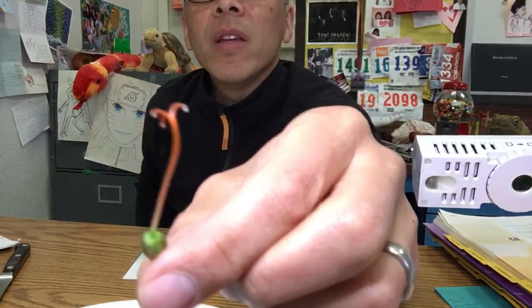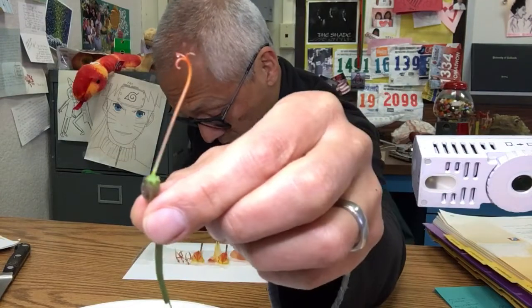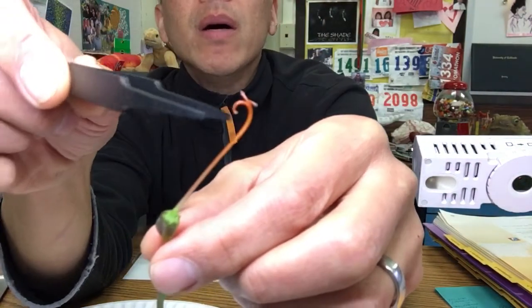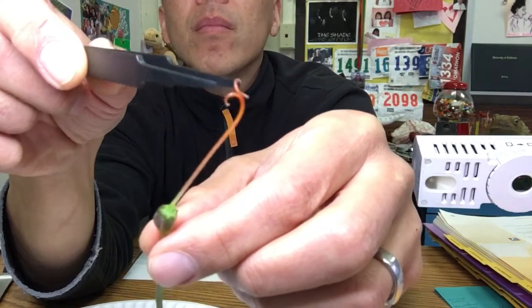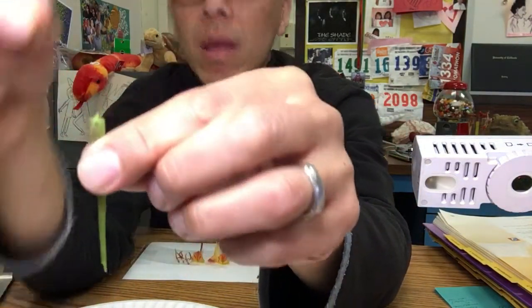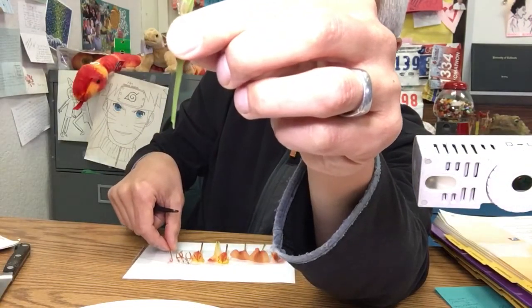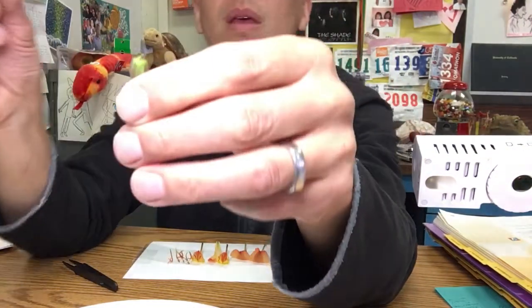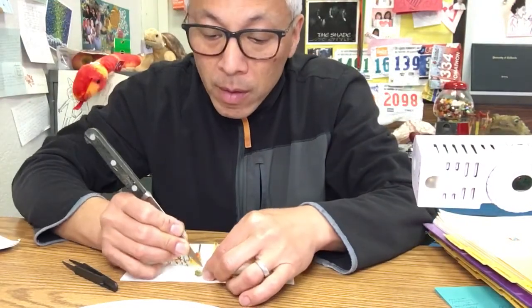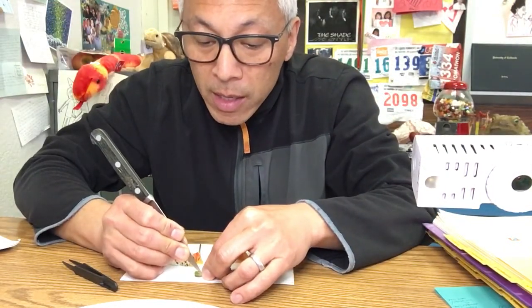What's left here is called the pistil, with the stigma on top. I'm going to tear that off. And now very carefully, with my knife, I'm going to slice this part right here so you can see what's inside.